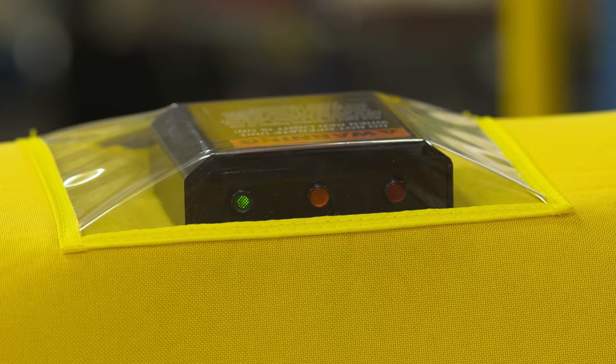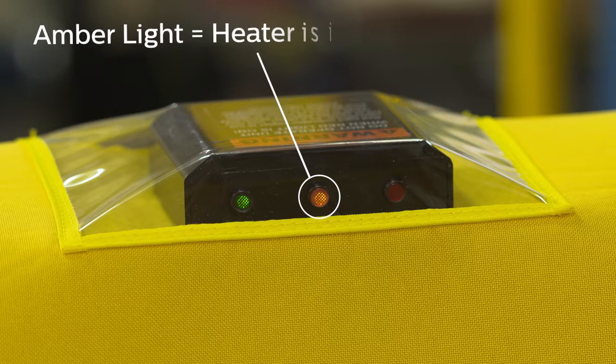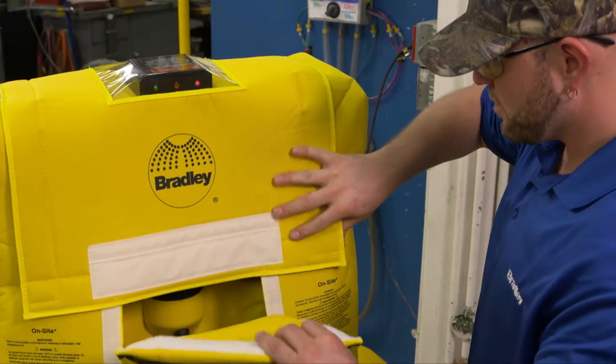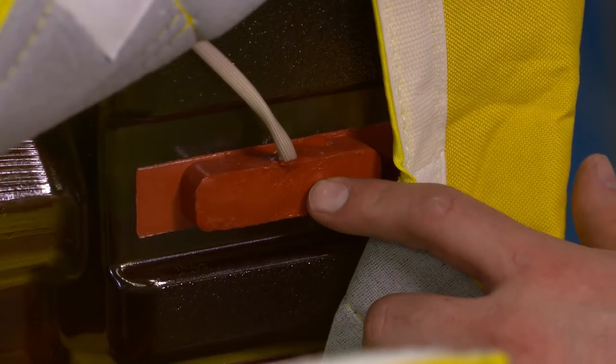The junction box has three light indicators. The green light indicates the unit has power. The amber light indicates the heater is in operation and heating the unit; the light will be on only while the heater is operating. The red light indicates the thermostat needs to be reset. To reset the thermostat, remove the top of the heater jacket and press the reset button.